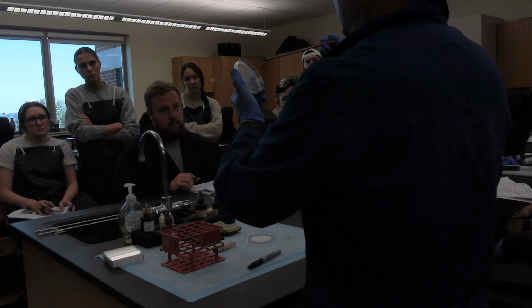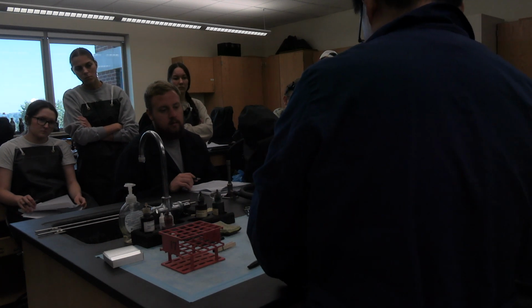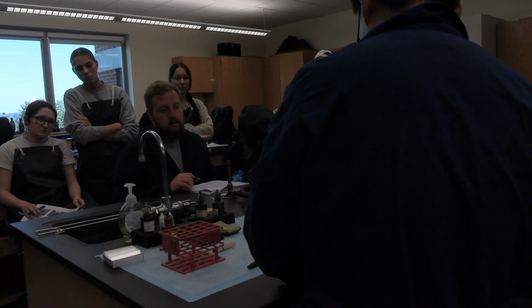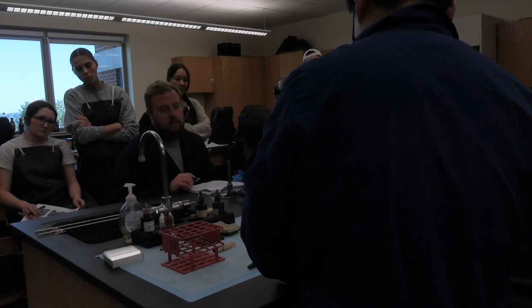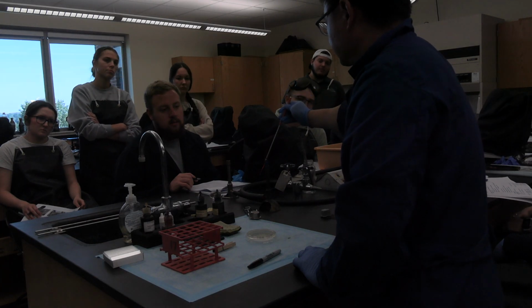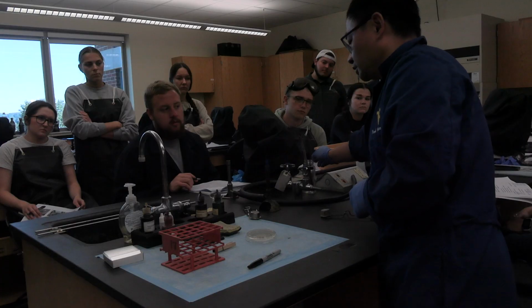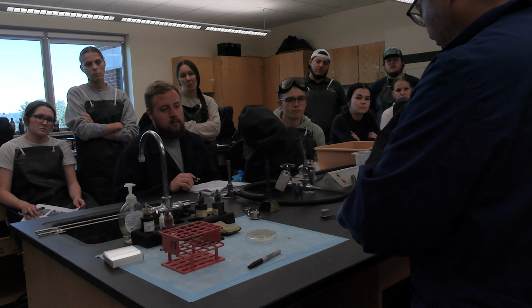Cool down, then you pick some bacteria. You can pick any one. Okay, I'll pick some, maybe 2 colonies. Now make a big smear, evenly on the surface. Okay, flame it again. Now you're going to wait 3 to 5 minutes to air dry.